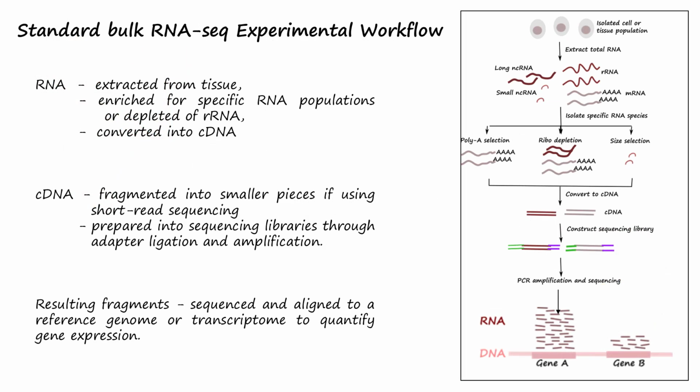The challenges in RNA-seq are reflected in the experimental workflow. In standard bulk RNA-seq, RNA is extracted from tissue, enriched for specific RNA populations or depleted of rRNA, converted into cDNA, and fragmented into smaller pieces if using short-read sequencing before library preparation through end repair, adapter ligation, and amplification. The resulting fragments are then sequenced and aligned to a reference genome or transcriptome for transcript quantification and downstream analysis.